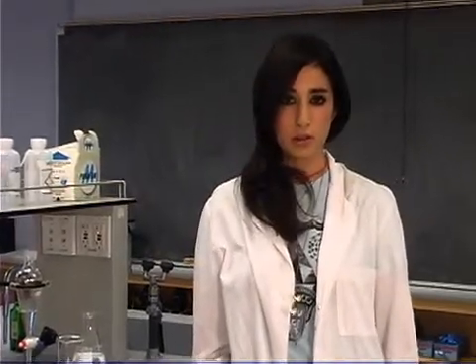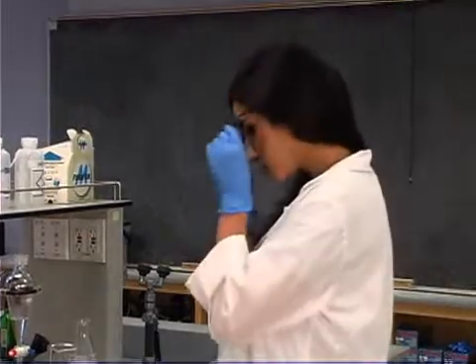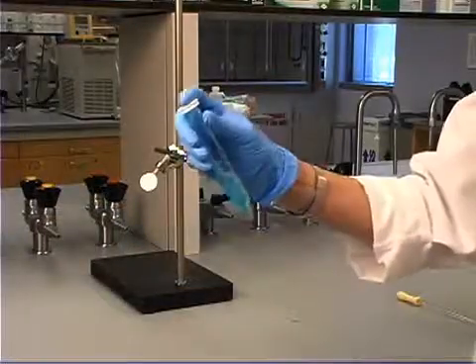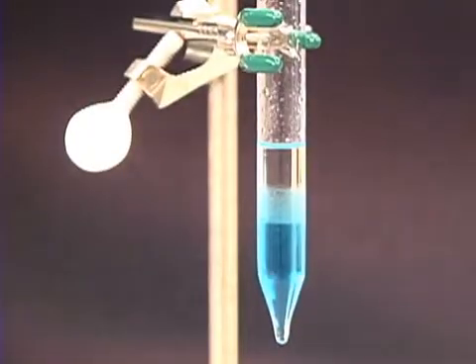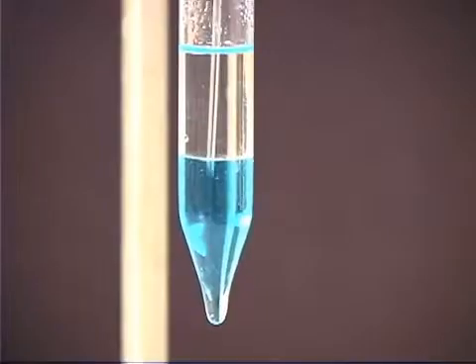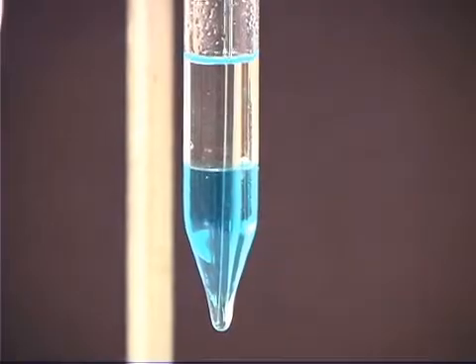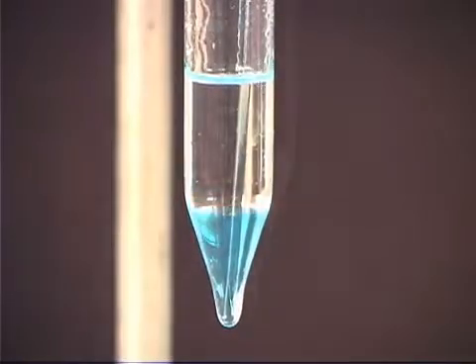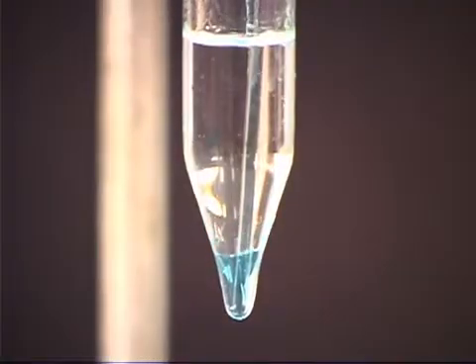Let's start with the micro scale extraction. Mix a tube containing two immiscible layers and allow them to separate. The aqueous layer can then be easily separated from the organic layer with a pasteur pipette. Always remove the bottom layer for better separation.